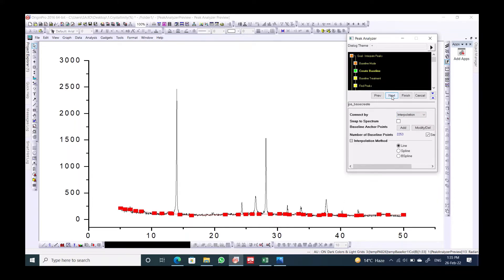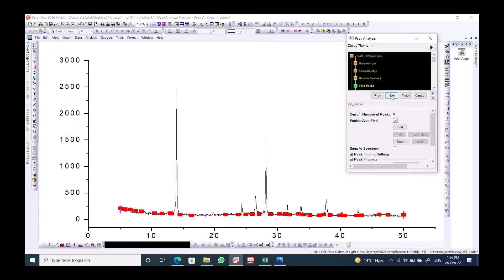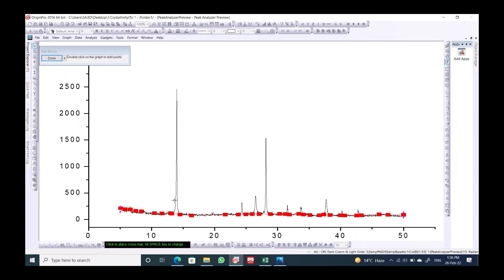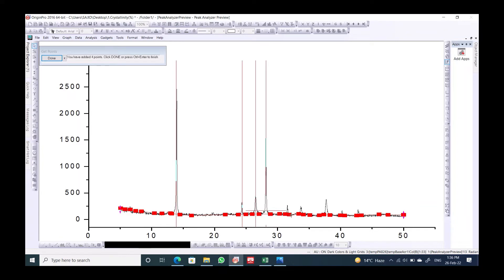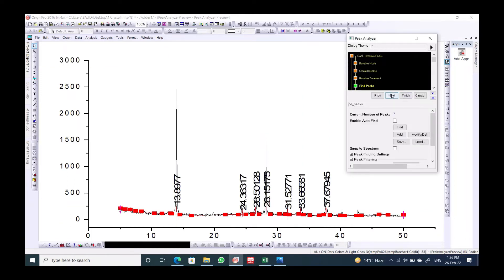Now click Next, then Next again. We need to disable the auto-detect option, then manually add the peaks we want to integrate in order to get the area. Select the peaks you want — this one, this one, this one, this one, and so on — then click Done and Next.